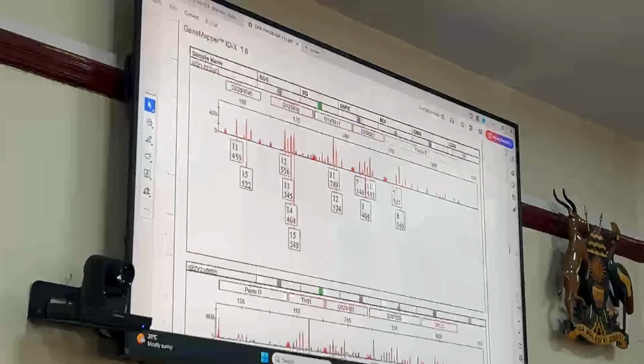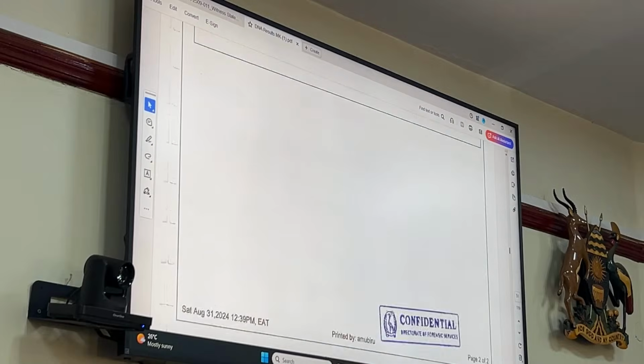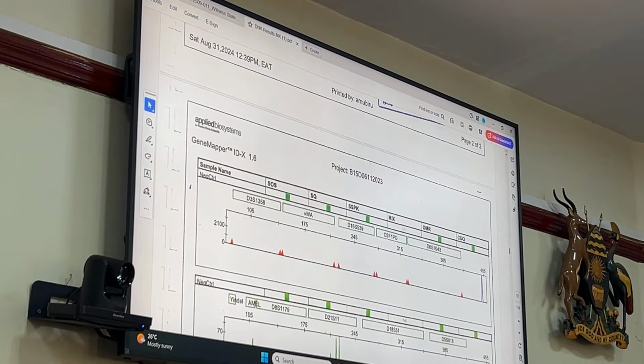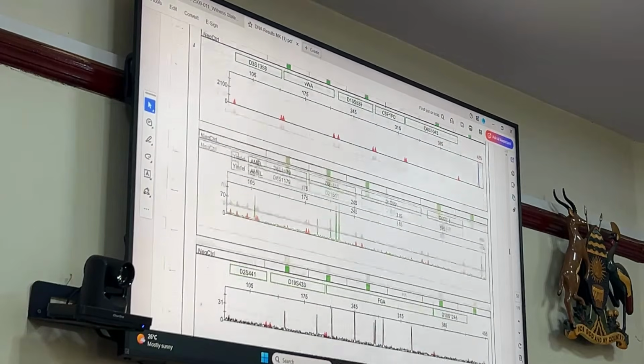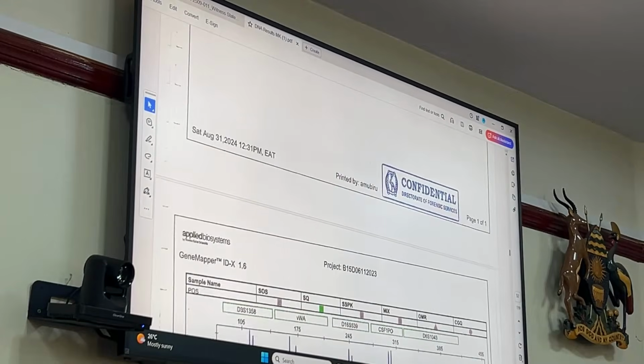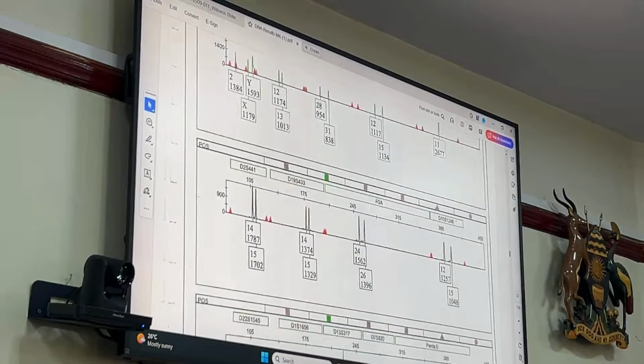There were 20, so it continues to sample 23. You can see that this is exactly the same project number. Yep. Then, equally within every batch that's processed through the DNA profiling system, a negative control is processed. And we'll come to that shortly. You have told us you could see the batch number, and then there's something else you could see apart from that.